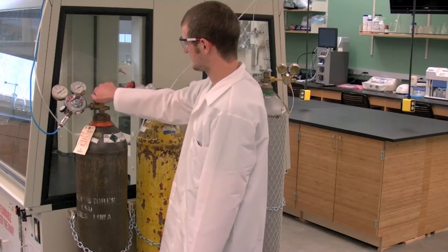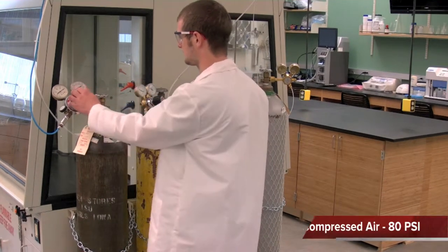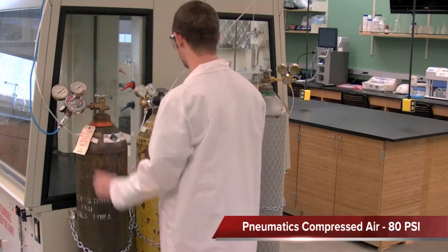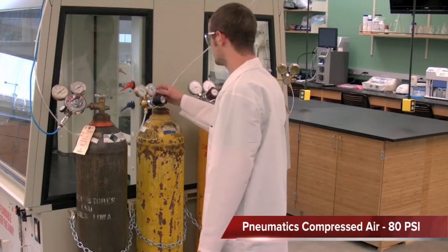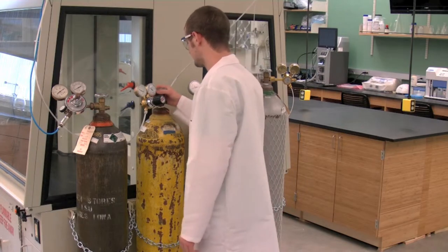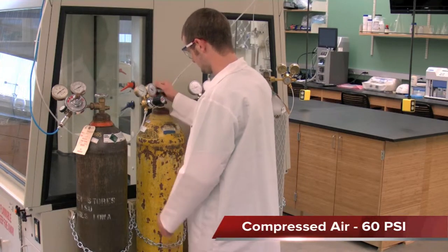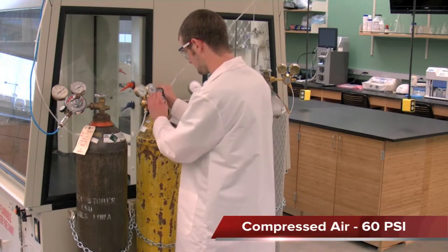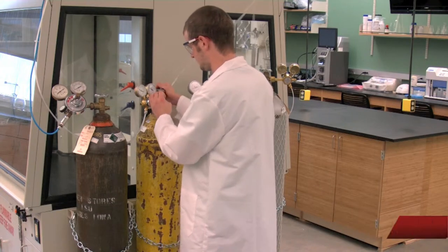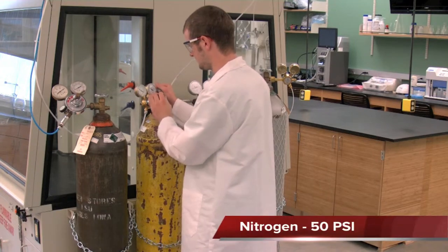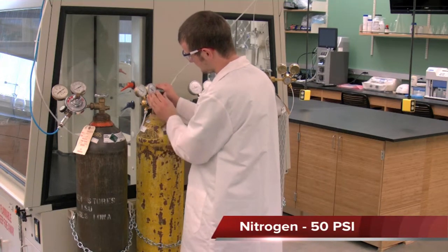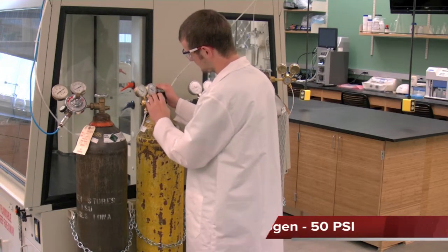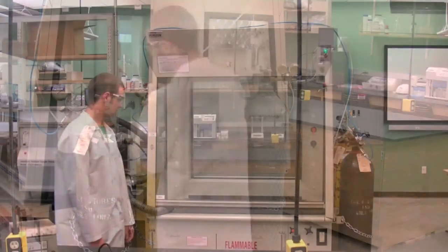First, make sure the compressed air cylinder for pneumatics is open and set to 80 PSI. Second, compressed air and nitrogen cylinders are open and set to approximately 60 PSI and 50 PSI respectively.